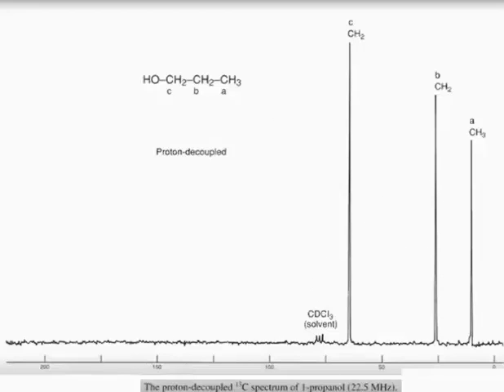Now, interestingly, in this one, you would normally see a TMS. For some reason it's not showing here in this example, but normally you'd see a peak right here for the TMS standard. That is, the C13 of TMS would show up as a signal which would be set at 0, just like was done for proton NMR. The solvent that's typically used in C13 is deuterochloroform. Now, because decoupling has been carried out, again you see 3 narrow sharp singlets, one for each carbon.